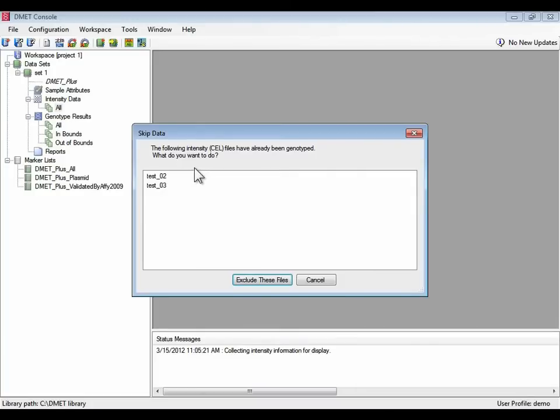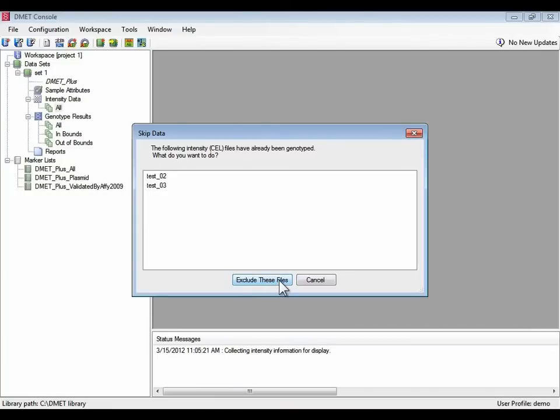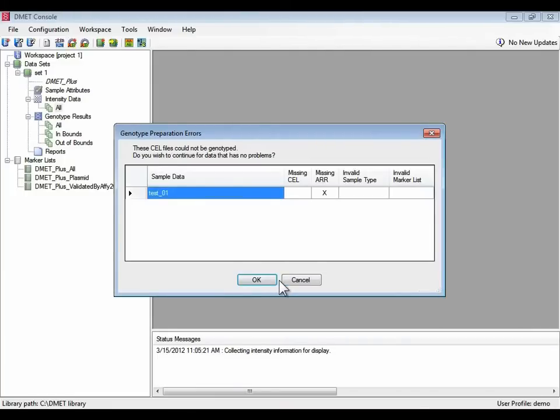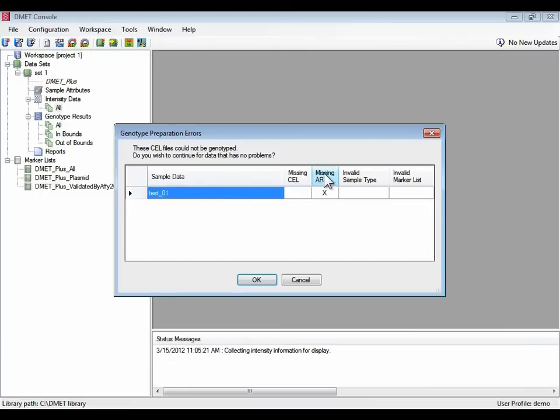Here's an example. Two of the files, like I said, have already been genotyped. So they won't be genotyped. We're going to exclude these files.